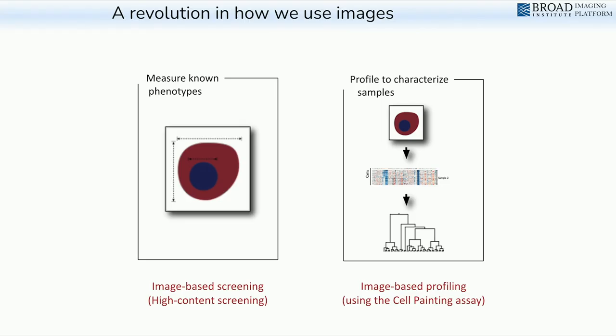What I'll talk about for the rest of today is image-based profiling, where instead of going after one particular thing in images, which might require measuring many features in order to diagnose, here we are treating images more as an unbiased data source. We don't know what we're looking for, so we're capturing all the features and looking for patterns in that data.